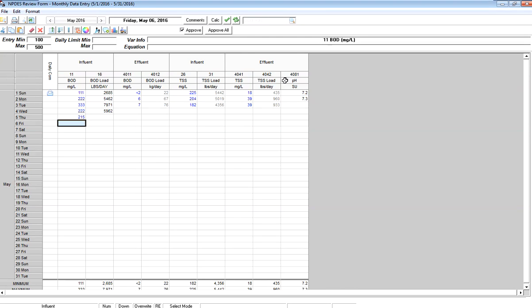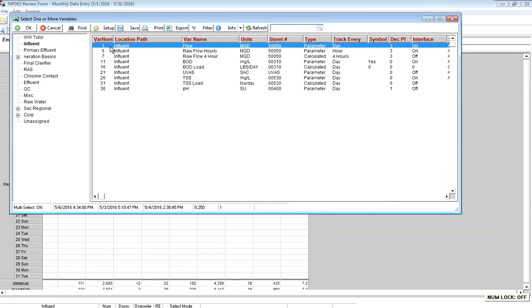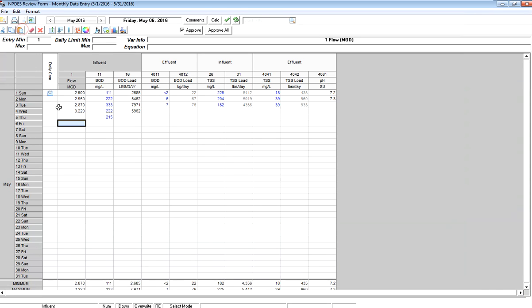I want to add the flow variable in because that is on my DMR report. I'm going to insert a column, go to my Influent location, pick my Influent variable, and bring it into the form. It's going to populate it there for me.